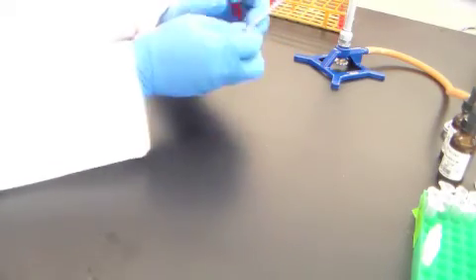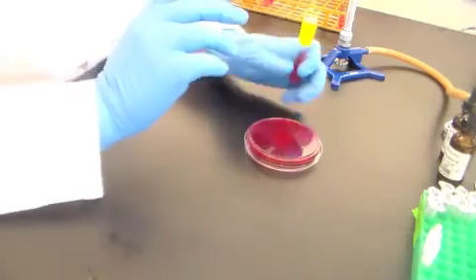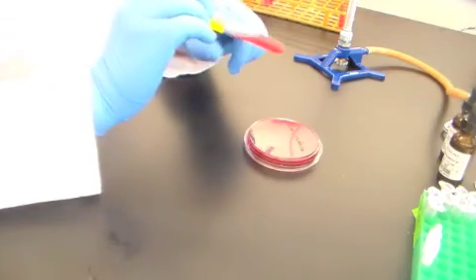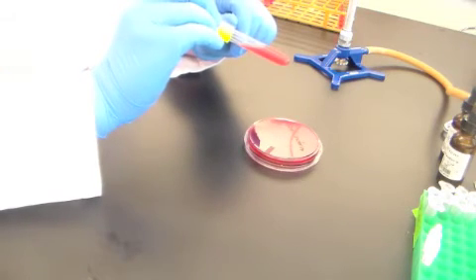The only media that you need to inoculate that's not in a plate form is at least one medium that you've already inoculated during the first week, just as a demonstration of slant media. But this week, you're going to deal with triple sugar iron agar again, these slants. This particular slant, it's important that you inoculate it properly, because you want to have bacteria growing not only on the surface of the agar slant, but down in the deep portion or the butt portion of this slant.